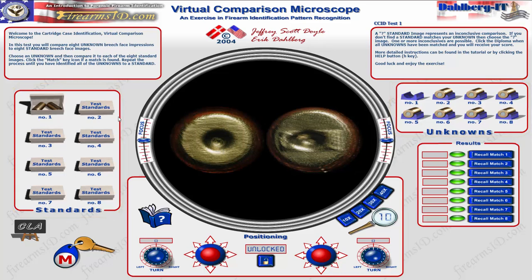The point of this tutorial is to give you a quick rundown of what all the buttons do and where to do everything. Right now I have two cartridge casings being displayed in my microscope, but they're out of focus.